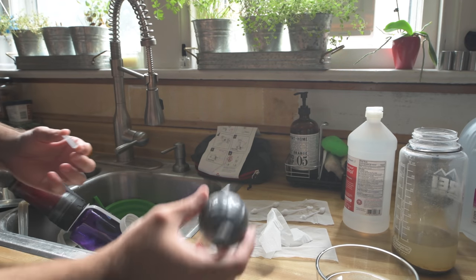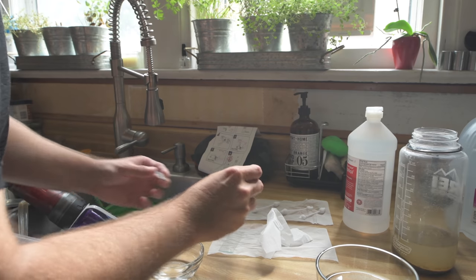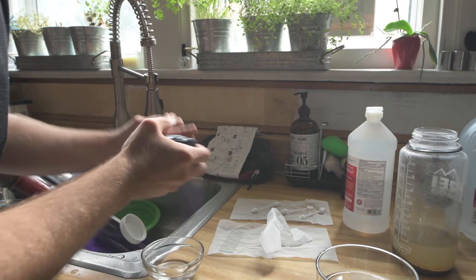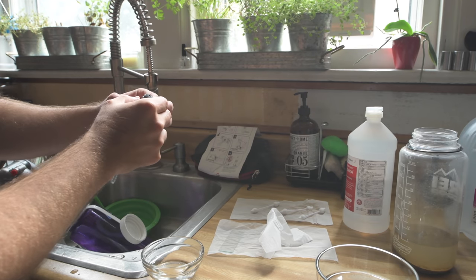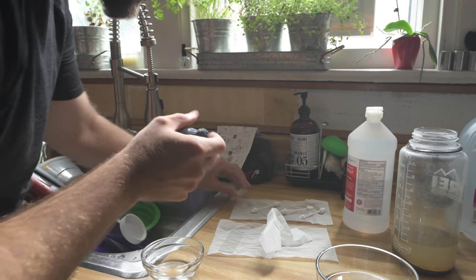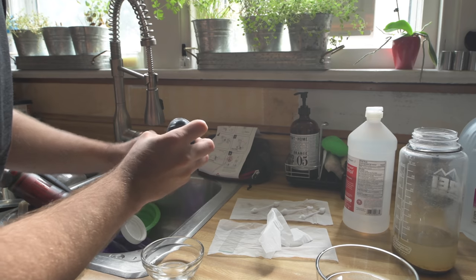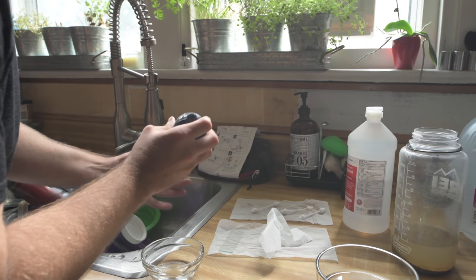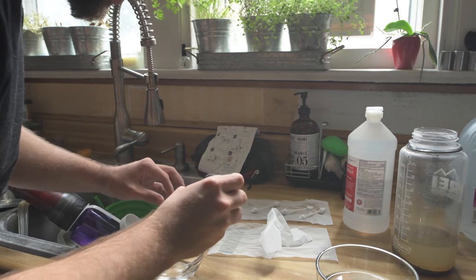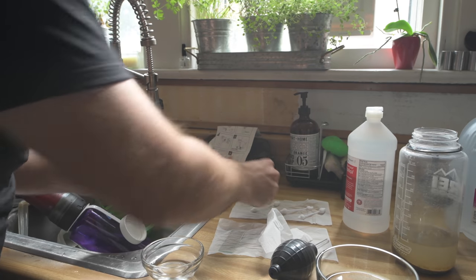And I'm just going to prepare this slide. These are fresh out of the box, but I got two cover slips there. I got three. One of my cover slips cracked, or a few cover slips cracked in the box, so I've got little glass shards all over my cover slips, unfortunately. So I'm just trying to blow them off, get as much glass off of there as I can.